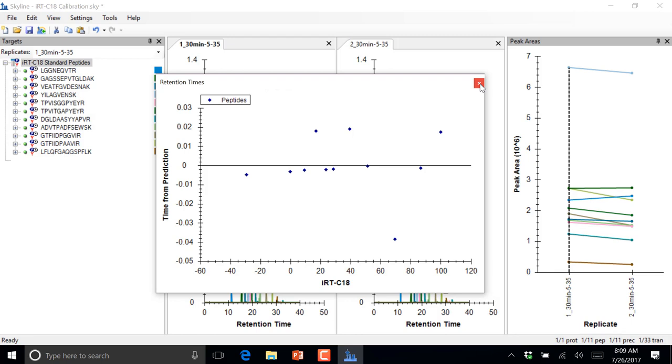Okay, so now we did that calibration. Let's just save that.